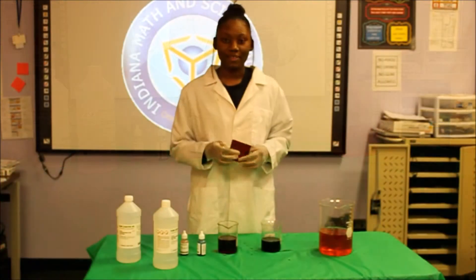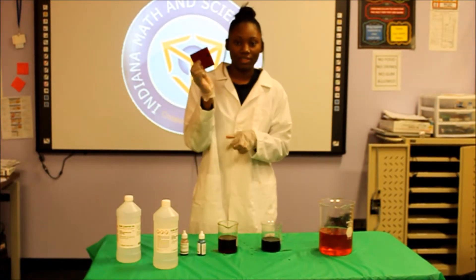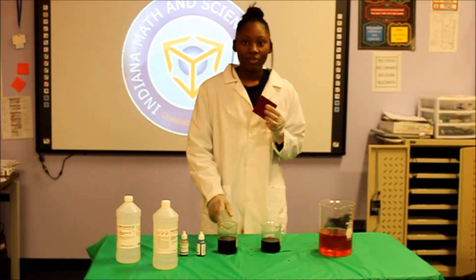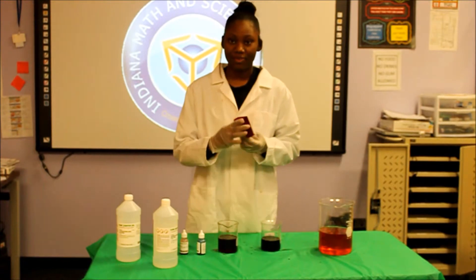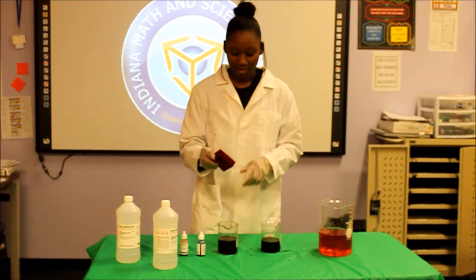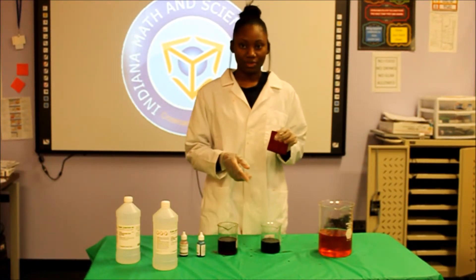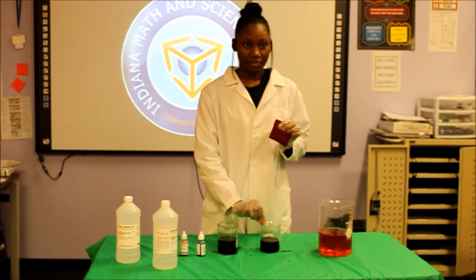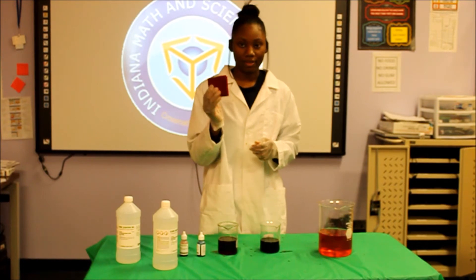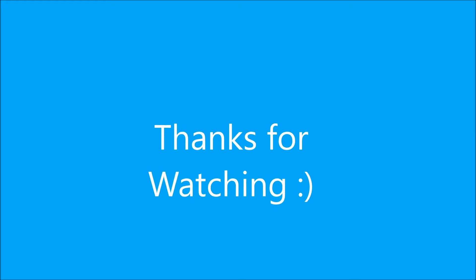So basically what happened in this demonstration is that I put this indicator sponge inside the red solution — this is also called Congo Red. When I put it inside the red solution, it's really acid. So if you put this indicator inside the acid, it's going to turn blue. And when you put it inside the blue solution, that is the base solution, it's telling you that there's no more acid on the sponge, so it's going to take back its red color. Thank you.